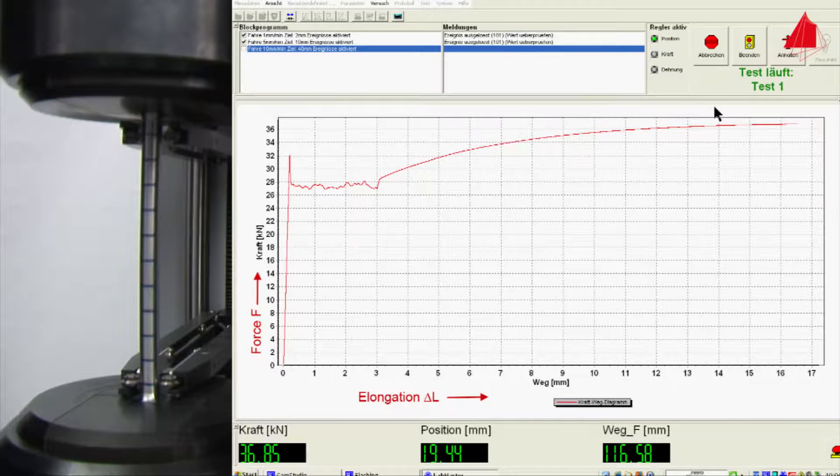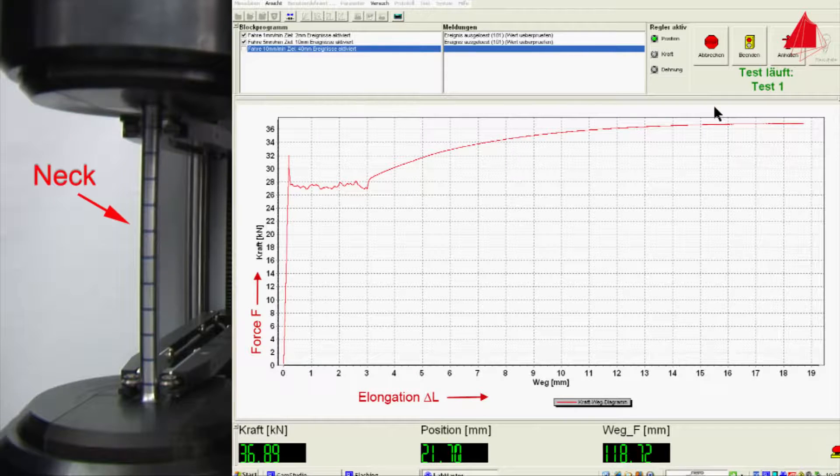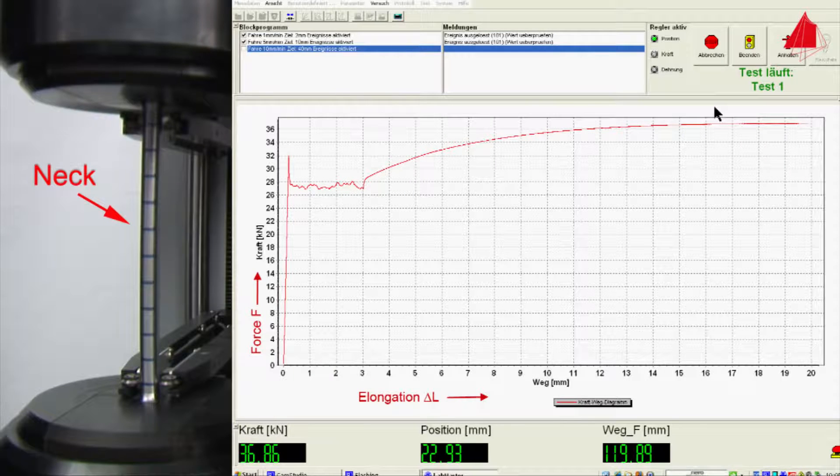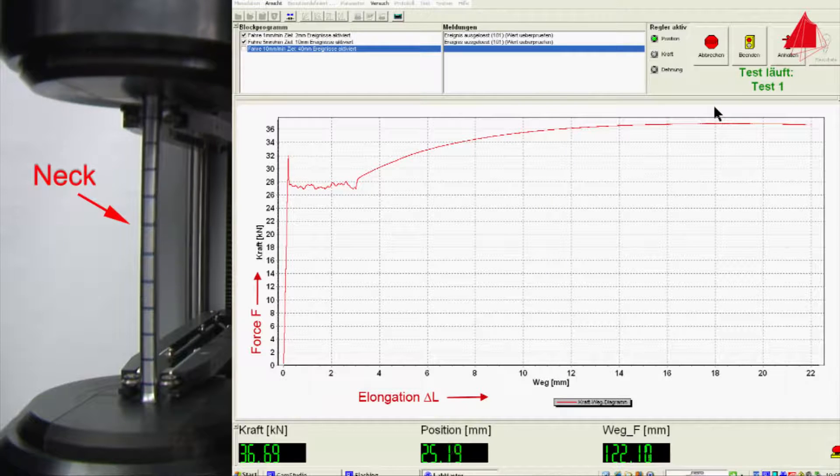As soon as the maximum force is reached, a neck begins to form at one point of the test piece. All further plastic deformation now only takes place at the neck, and eventually the test piece fractures there.